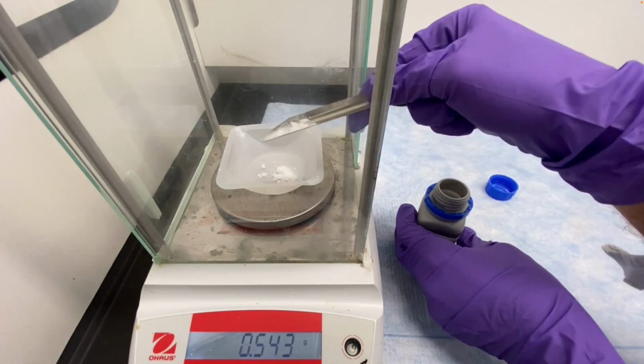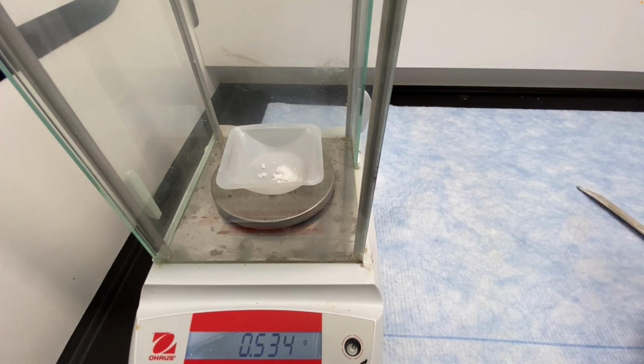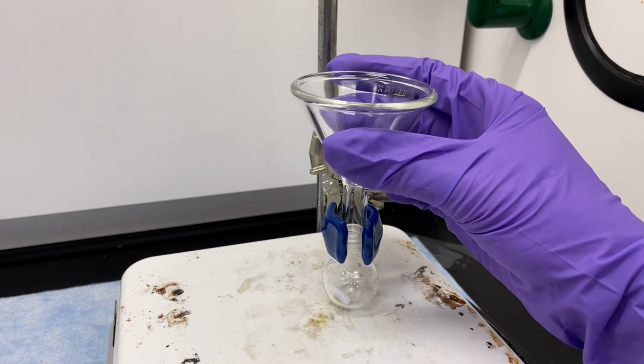You'll see me doing that in another example here, just because this is so clumpy and so wet. You can see the clumps in the weighing boat. I had to turn the spatula over.